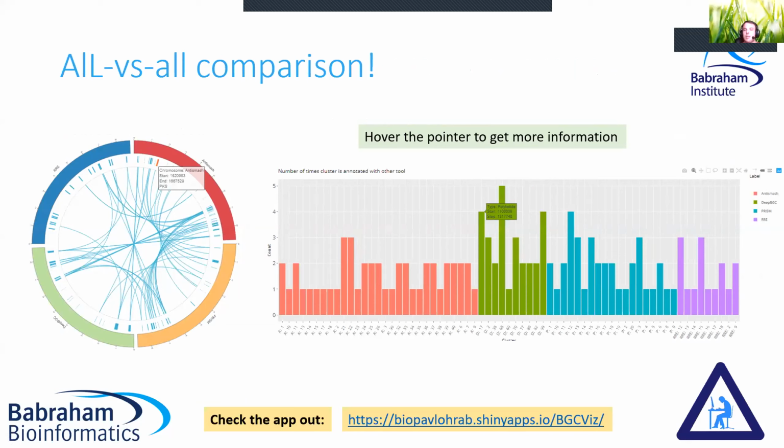So if a cluster is annotated by many tools, it must be something. So this something was caught by different approaches. Here you have a circos map with links and a bar plot which tells us which cluster was annotated, how many times, with how many tools.